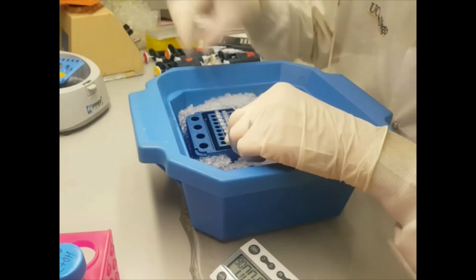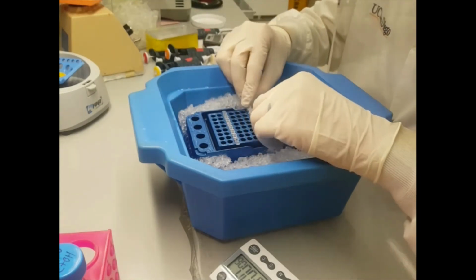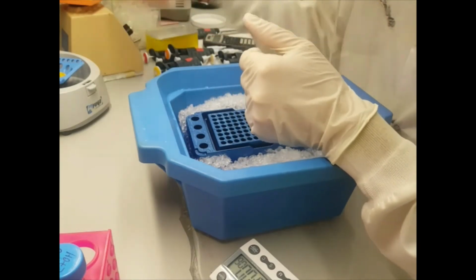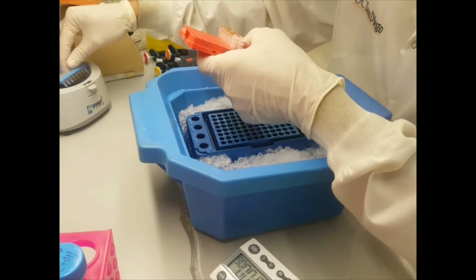Next, exchange the lids to add the CIP2 master mix. Mix the samples well, quick spin, and incubate at 37 degrees for about 40 minutes.